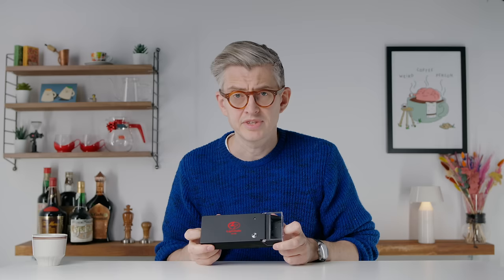The reason I was so interested to get it is because there's been loads of studies on caffeine, but honestly, most of the time I haven't really trusted the quality of coffee they were brewing or the quality of brewing that they were measuring. Suddenly I could do a bunch of tests and get real answers relevant to the coffee that I drink and that you drink at home or in cafes. First I'll show you how this machine works, then we'll cover things from instant coffee to espresso brewing to roast levels — and there are some surprises.